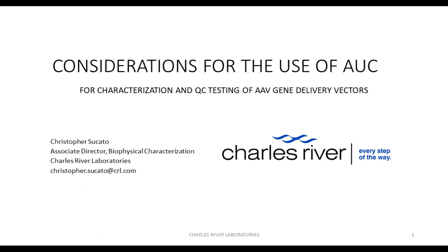Today's topic is the use of analytical ultracentrifugation for characterization of AAV gene therapy delivery vectors.